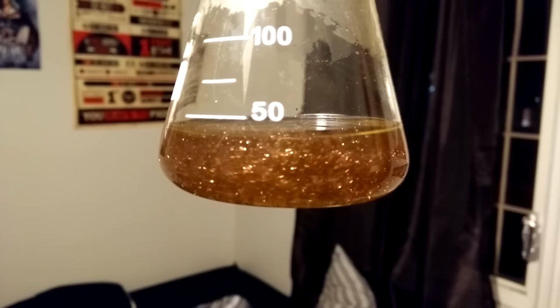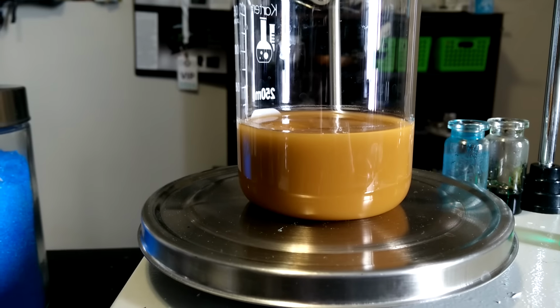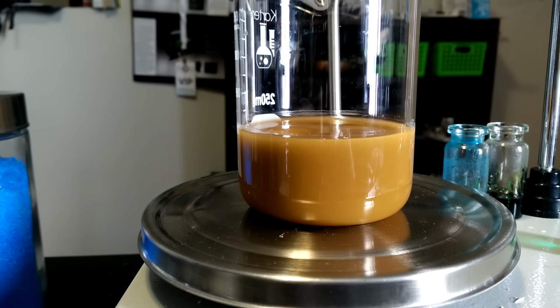Copper is and always has been my favorite element. Not only are copper compounds useful, they have uses in almost every aspect of science. Copper can usually exist in two oxidation states, +1 and +2. If you're making any sort of electrical device, copper-1 compounds tend to be better.